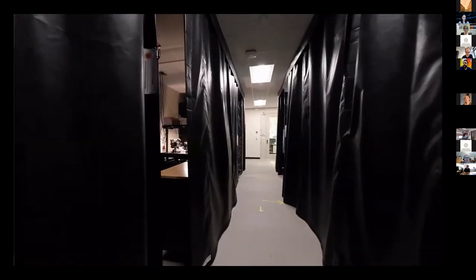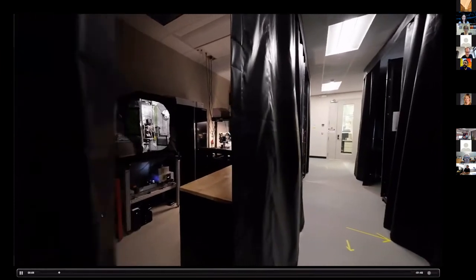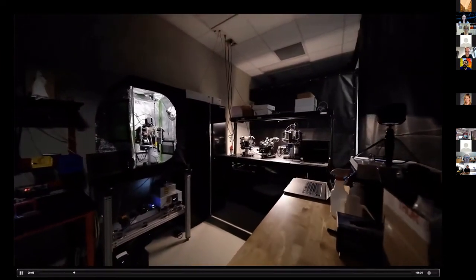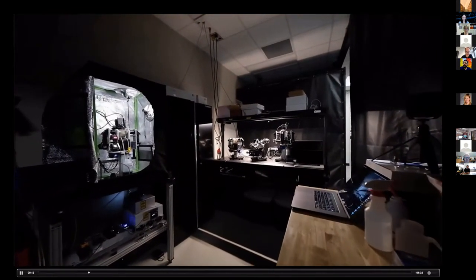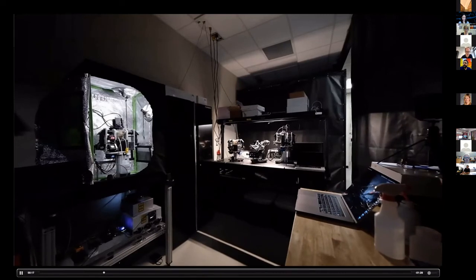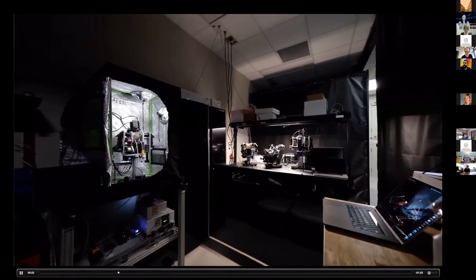So here's just a quick walk into the lab back in Madison. So you can see there's actually a total of 4 flamingos here in the lab. One is here on the left in a tent. So that helps to block the light and also for temperature control. And then there's 3 flamingos here on the right on one optical table.